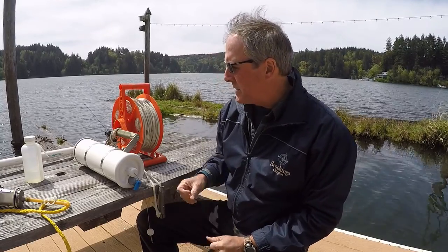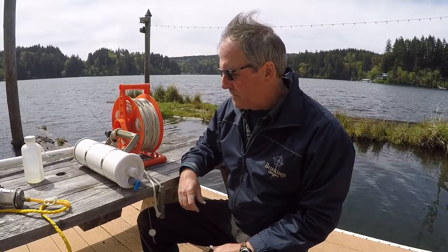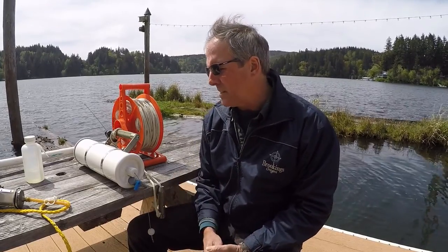Got another lab for you today. We're going to be talking about the Van Dorn bottle. We've talked in the previous sessions. I'm not exactly sure which order you're going to be viewing those in, but hopefully you've seen the one on the multi-parameter probe, because that's used quite oftentimes in conjunction with this.